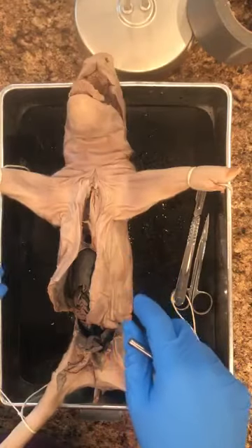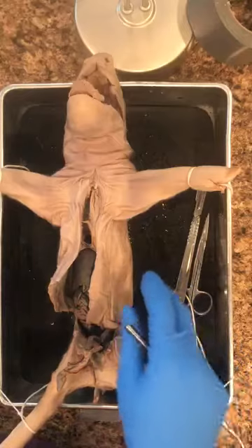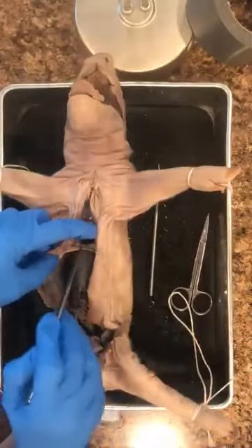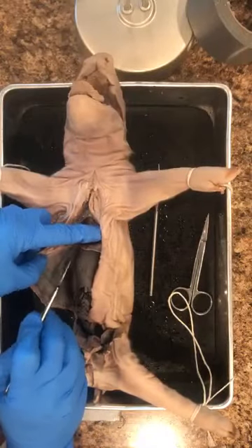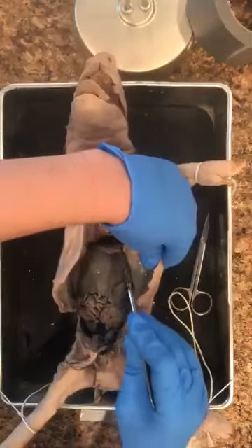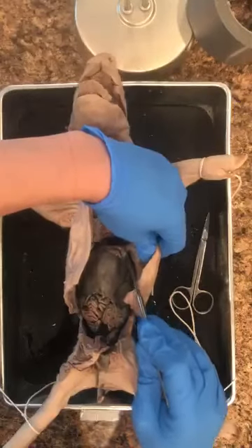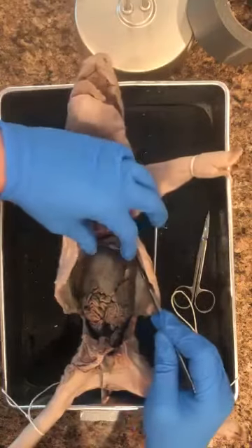So as you contract your diaphragm, your lungs are filling up with air. So it's just a big muscle. And I do need to cut that along the sides of the body, or I won't be able to open up the pig.